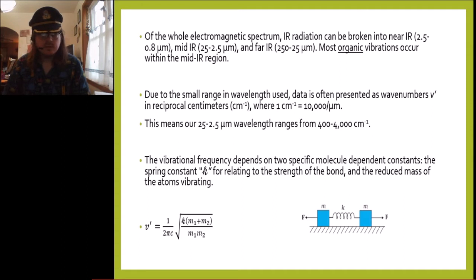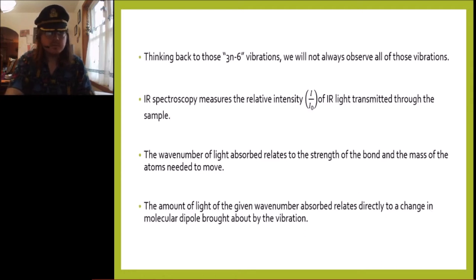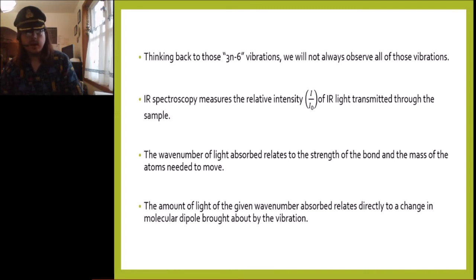Now, what's going to happen here is that the vibration is controlled by several things. One thing is a spring constant, which depends on the bond itself, and the second thing is the reduced mass, which is the two masses that are stretching on that spring. So the heavier the mass, essentially the more energy it's going to take to vibrate those springs. So we're going to shoot it with infrared radiation of a certain intensity, and we'll measure it versus standard and see how this is absorbed.